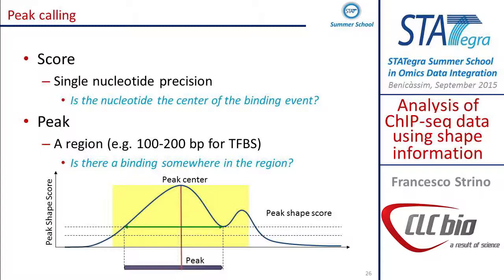So then once we have this level, we just cut this level and take everything from here to here. So that's how we get a peak.